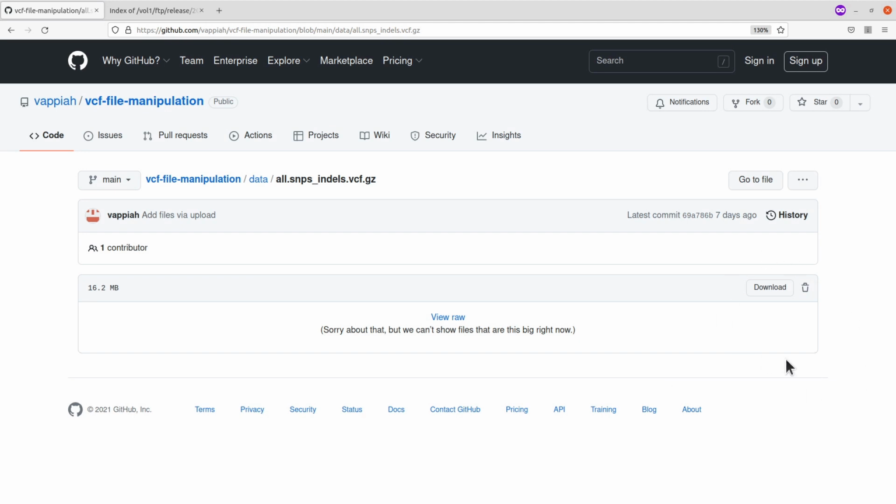The other approach is used if you are working on a remote server where you have access to only the terminal or the command line. For that, you need to have the download link. Okay, so that is what you need. So to get the download link, still bring your cursor over to the button. And then what you do is to just right click it. Okay, so once you right click it, you go to this copy link here and then just click on it. Okay. So I am using a Firefox browser, so this is how I do it. But you can use the other browsers to get the download link too. So once you have this download link, you move to the terminal and continue from there.